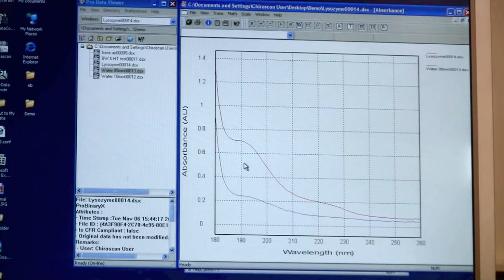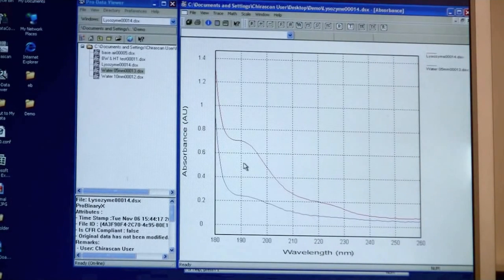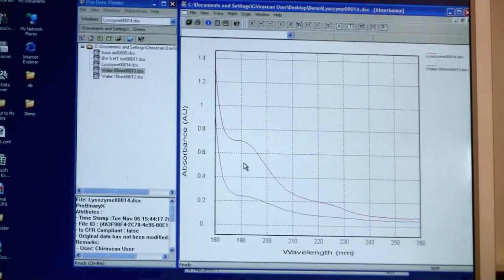Once you know what concentration to use of your sample, you can then start your experiment.